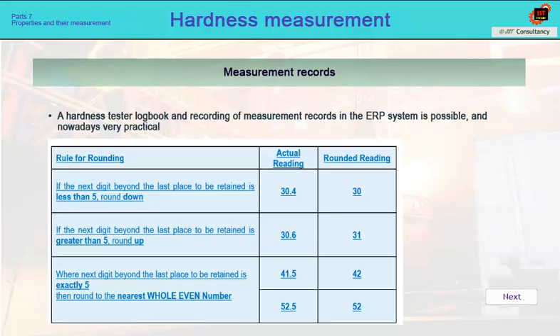According to this standard, Section 6, values can be rounded, as follows according to the table. Values after the decimal point less than 5 are rounded down to the nearest whole number. Values greater than 5 are rounded up.